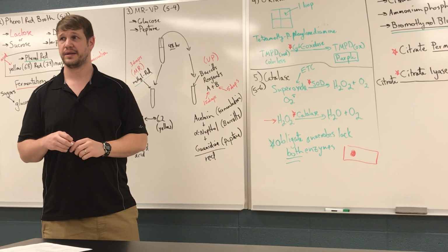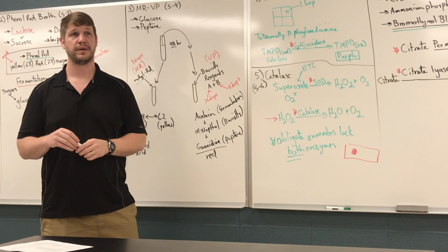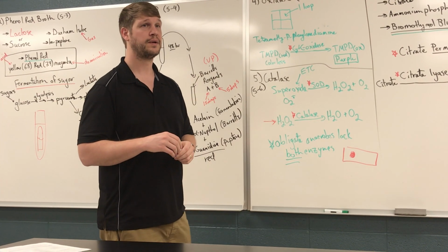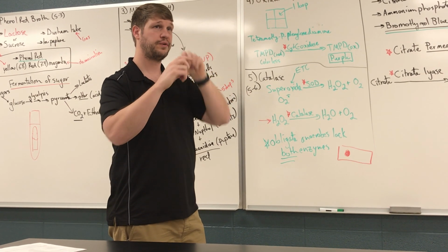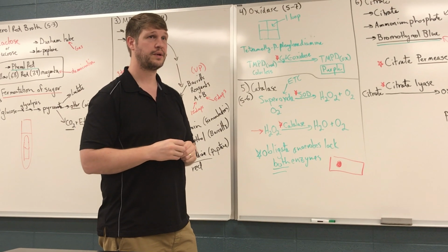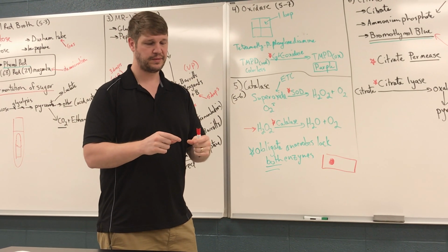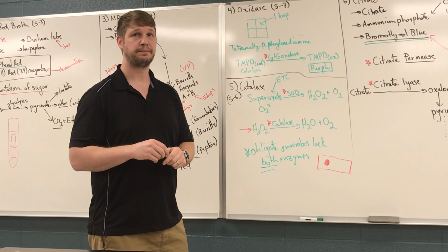Questions about that? Can we put all four of our organisms on one slide, or should we use separate slides? Just use one slide, but a separate window for each of the four organisms. No, I mean like number 5. For number 5, yeah, you can use a clean slide for each one. It'll be fine.